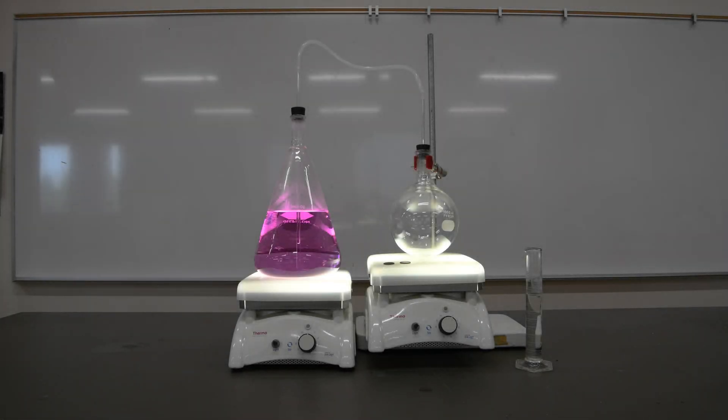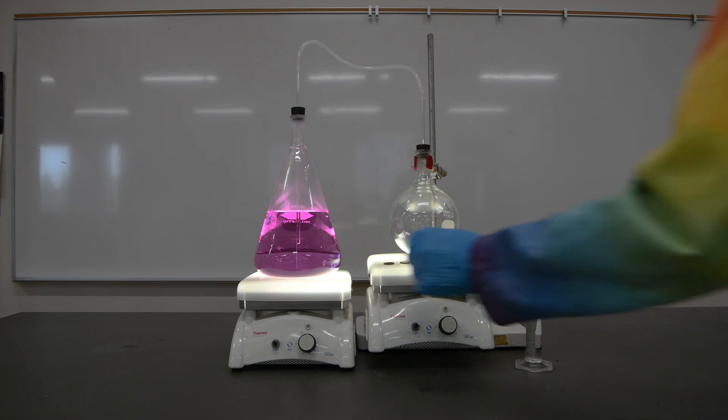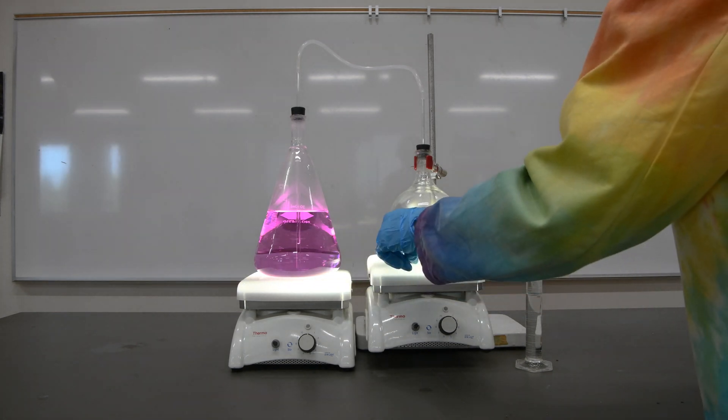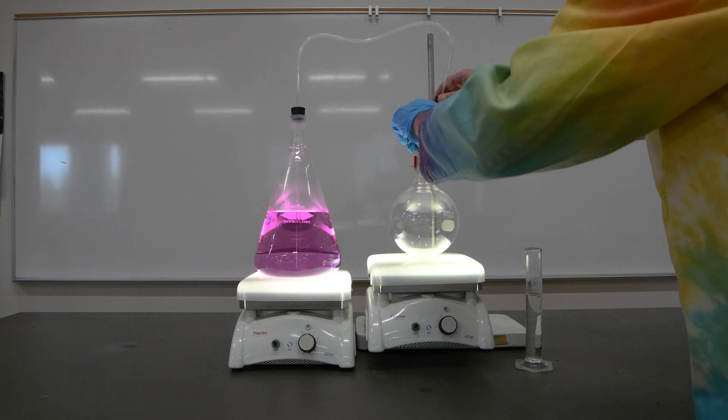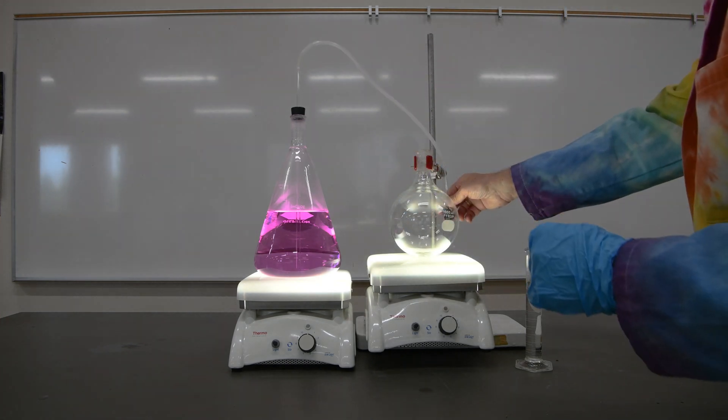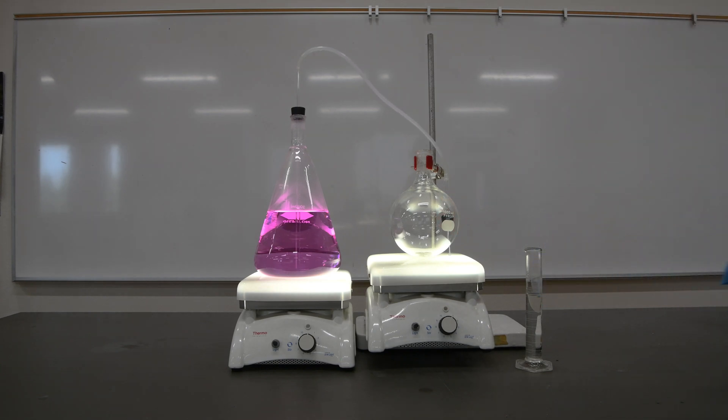All right, the first thing we'll want to do is to put two pennies into our round flask. These are old pennies before 1983, when pennies were still made of copper. You have to make sure you use a penny before 1983.